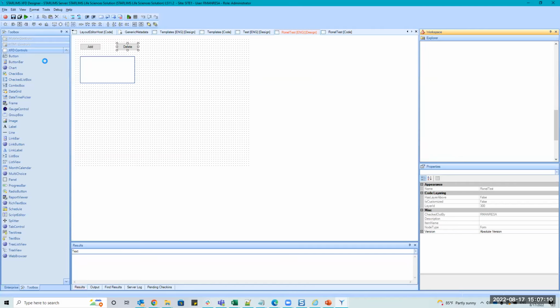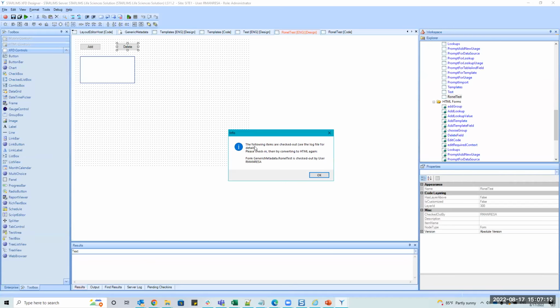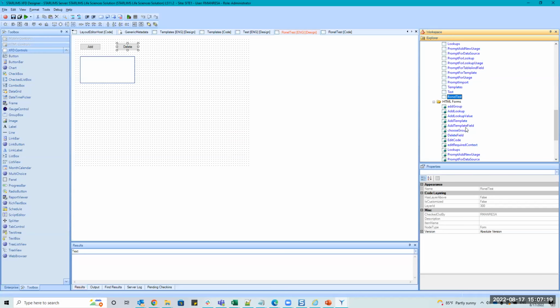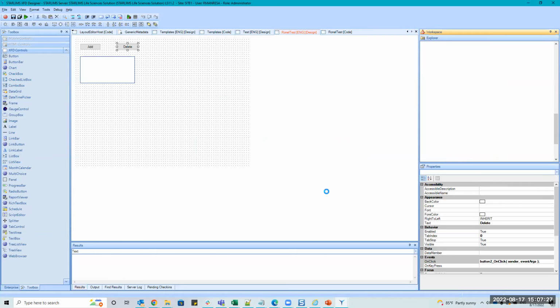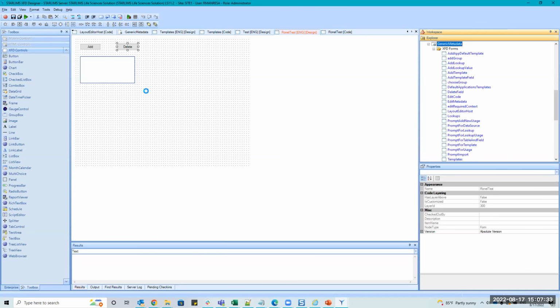But it was great, right? Because it simplified having to recreate all of this. The conversion did it for you. I think it complained that I haven't checked that. Let me just check in. Try it again. So, but it got you, like I said, 85% there.